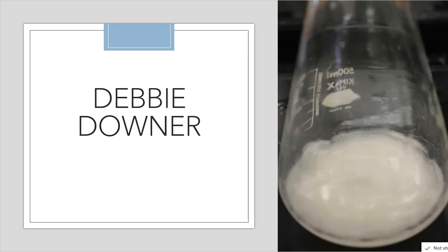Now, after I do all of that, I then see something that's happening down into the flask that sits below, and this is what I see. Folks, what do you see there? I hope that you tell me some precipitation, some solid product that's beginning to form. So this means that something's happening. Maybe I didn't give it enough time to really filter out, but something's happening down into my filter flask where these crystals are beginning to form after it goes through the filter.